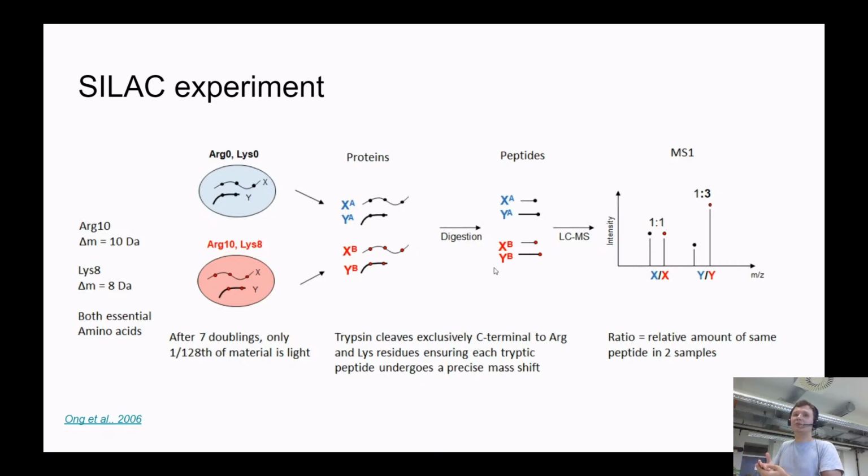Why is it cool? Because imagine the experiment may not be so robust. You can treat a sample with protease for 10 minutes, and tomorrow treat another sample with protease for 11 minutes. Not seeing this difference, you can introduce some biases. But treating all of them simultaneously, all these biases are uniform across the first sample and the second sample. After that, you take these peptides and measure them with mass spectrometry.